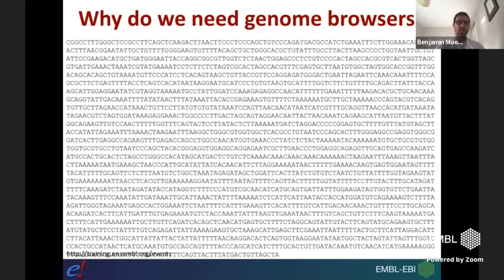So one of the most important things that we annotate on the sequence itself is the genes. And we think obviously about the genes that are composed of individual transcripts or splice variants. And we think about the biotype and whether they're protein coding or non-coding. And we annotate that all across the genome. We also annotate variation data and also other features as well, such as promoters and enhancers that can regulate gene expression.